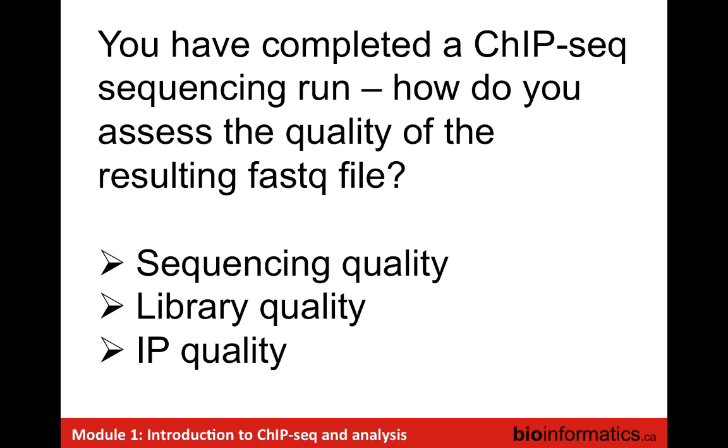Okay. So now you've completed your ChIP sequencing experiment, you've gone through the molecular biology, you've gone through the sequencing, you've got your FASTQ file. How do you assess the quality, right? This is a fundamental question. You always want to make sure that your data is good before you start doing stuff with it. So how do we assess this, right?